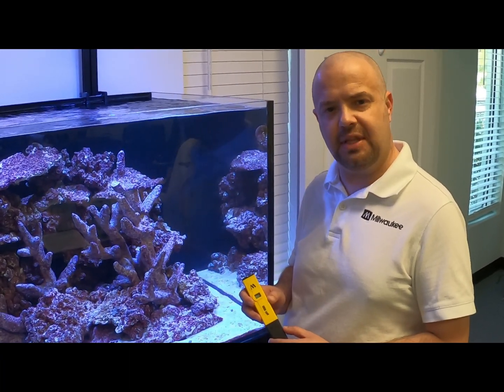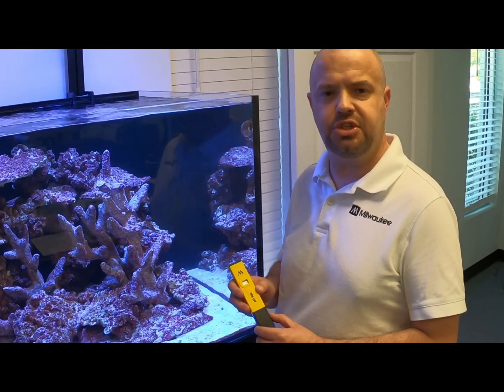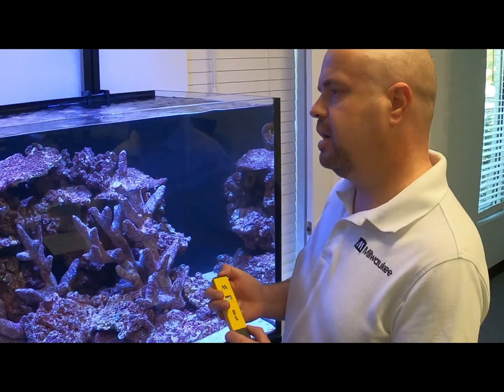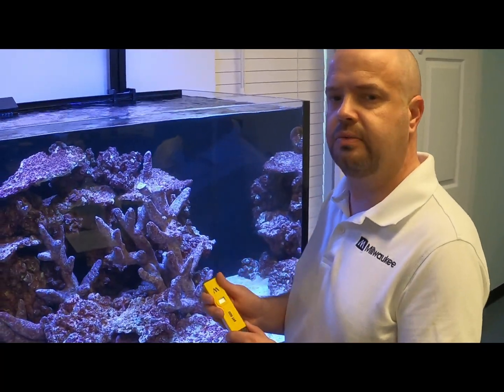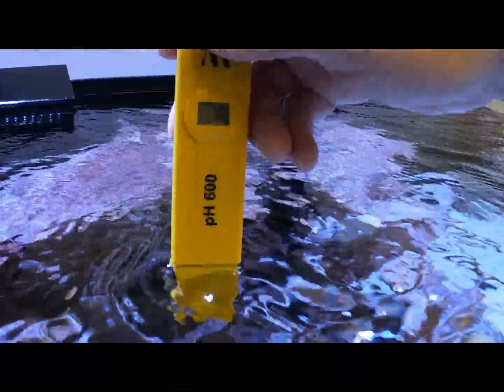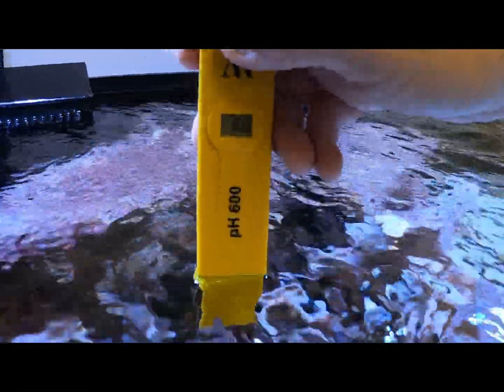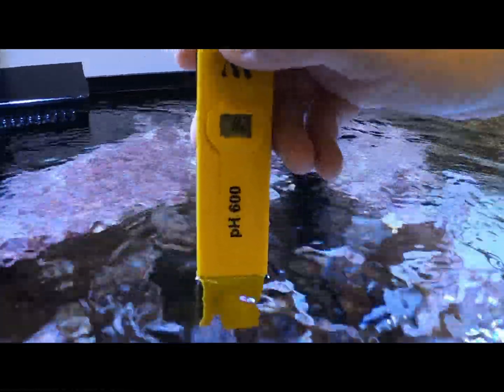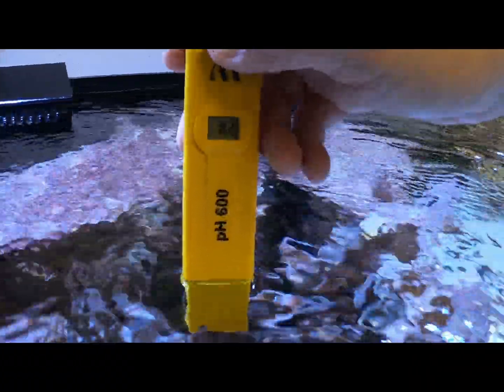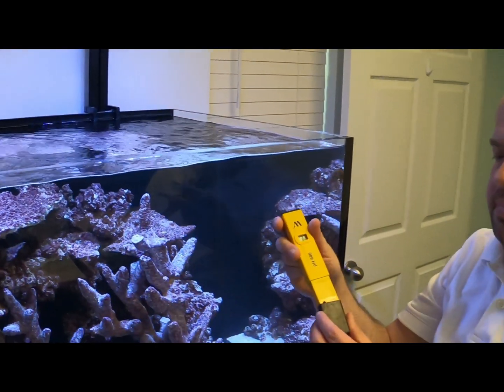We recently installed a saltwater aquarium here at Milwaukee Instruments — let's check the pH in the water. It should be around 8.2. Turn the unit on and we're just going to stick it in, and that's exactly where it needs to be. Simple and easy.